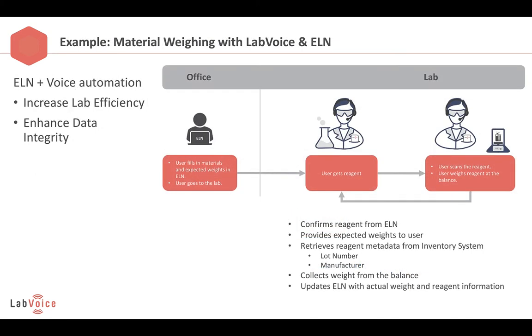So how can we make this better? And that's where LabVoice comes in. As you may have guessed, since the clue's in the name, LabVoice are a voice automation company, and we've worked with them to pair their technology with the ELN. As with all the examples in this talk, the aim is to both improve the efficiency of data capturing and to ensure it's captured in such a way that it guarantees its integrity.